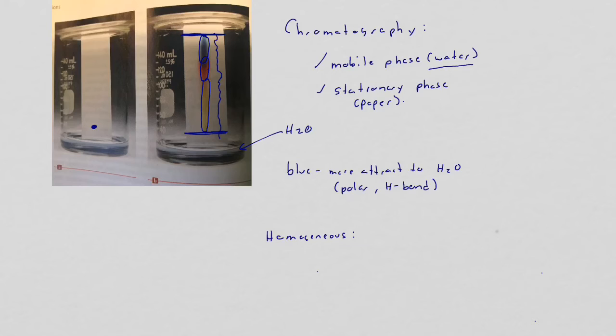Now, you could use a different solvent. You could use an organic solvent that is nonpolar. If, let's say, you use a nonpolar solvent instead, then whatever travels furthest in the nonpolar solvent would probably be also a nonpolar molecule.